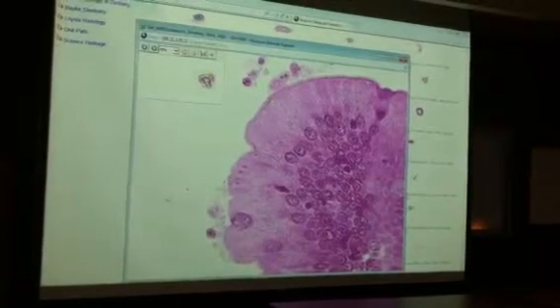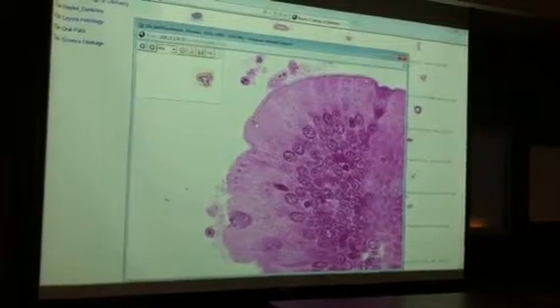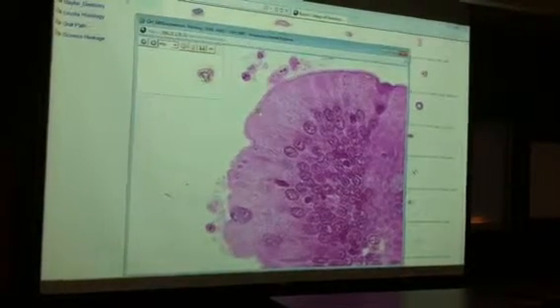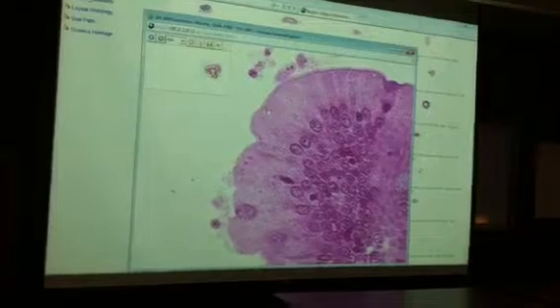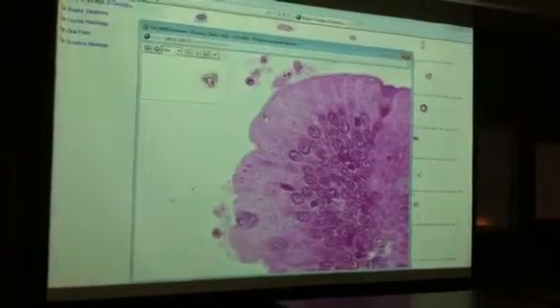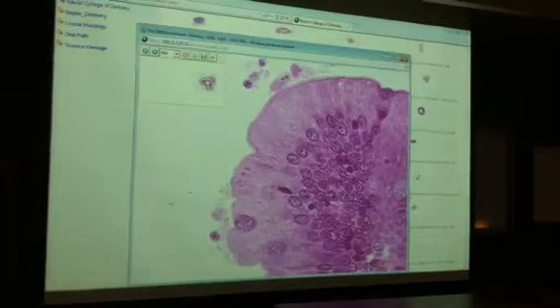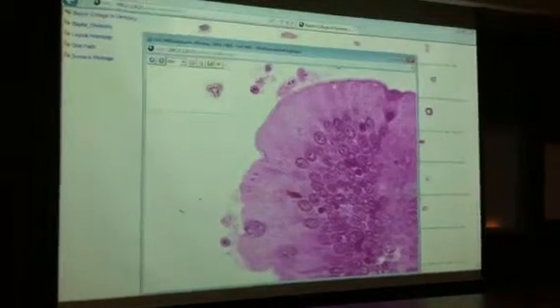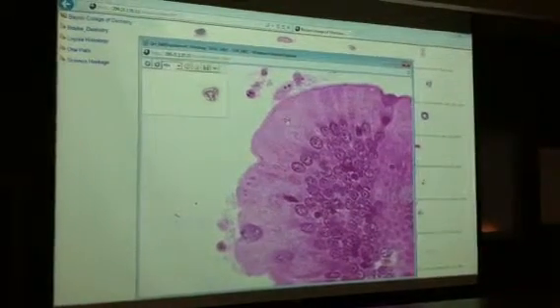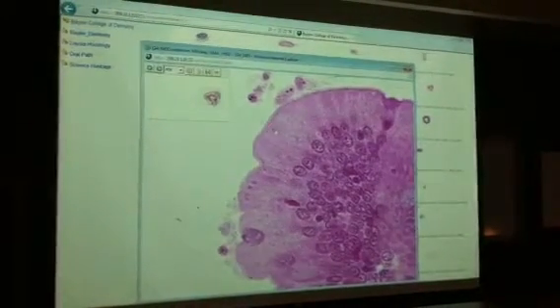Okay? This line right here is really what represents the terminal bar, where we have our junctional complex. Everybody remembers what a junctional complex is, right? Those three: tight junction, intermediate junction, desmosome. That's what the dark line represents, because all these cells have junctional complexes attaching them together. Because you want to absorb into the cell, but you don't want stuff leaking back up between these cells.